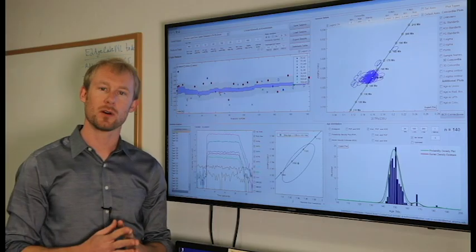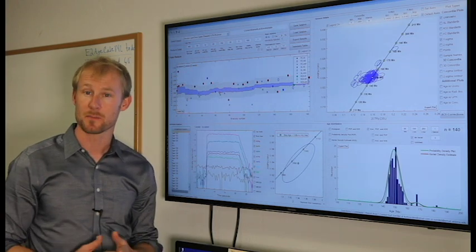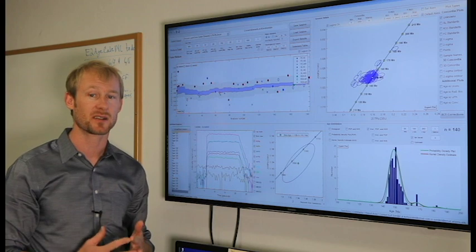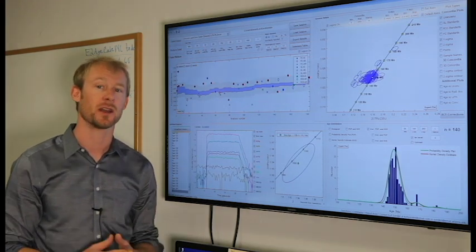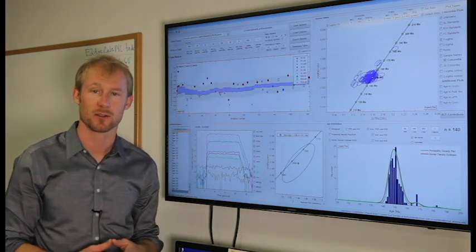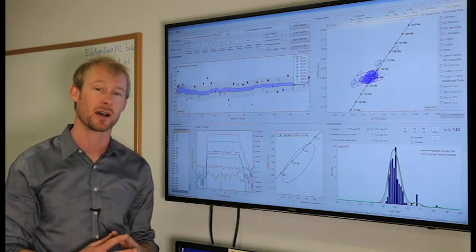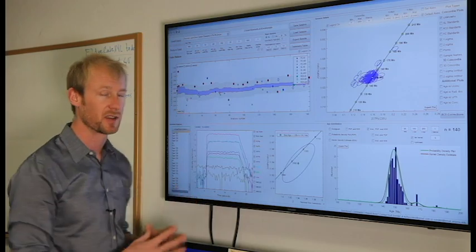in real time. Although this software was developed in MATLAB, it is deployed and runs outside of MATLAB as a standalone desktop application that we provide free to the uranium-lead geochronology community. So there's no need for the researcher to actually have MATLAB installed on their machine to run this program.